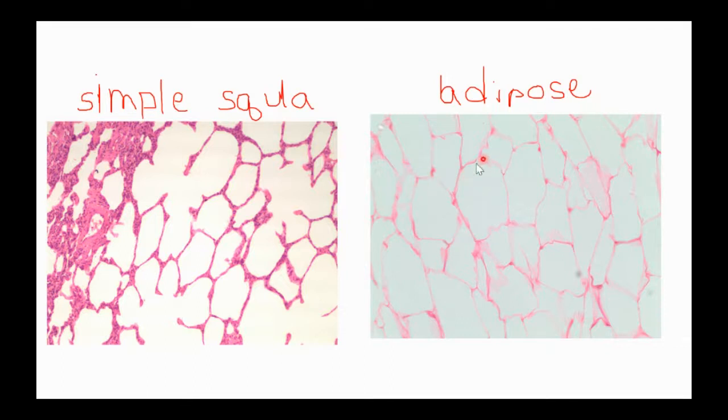There's a special name for these cells here in adipose tissue. I know it's a long thing to make you type. Do we remember what the name of the type of cells in adipose tissue is? Yeah, a couple of us are typing it, and it's a long word, right? We are looking at cells called adipocytes. Adipocytes. And in particular, like a couple of us mentioned, these adipocytes that we're looking at in these pictures, and in the pictures I'll show you here in a moment, these are examples of the adipocytes in white fat.